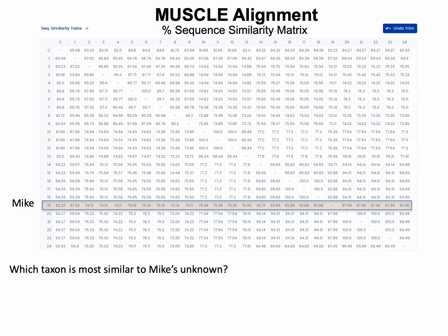Here's the sequence similarity matrix for Mike's sample. Which taxon is most similar to Mike's unknown? Go ahead and hit pause until you know the answer.